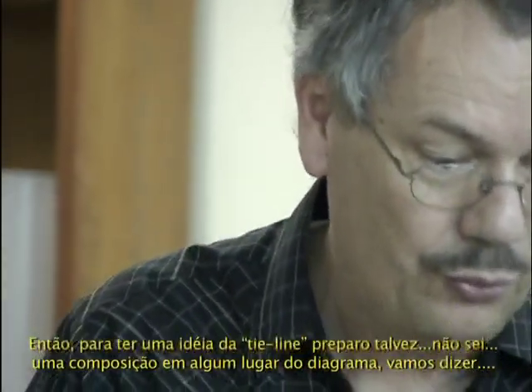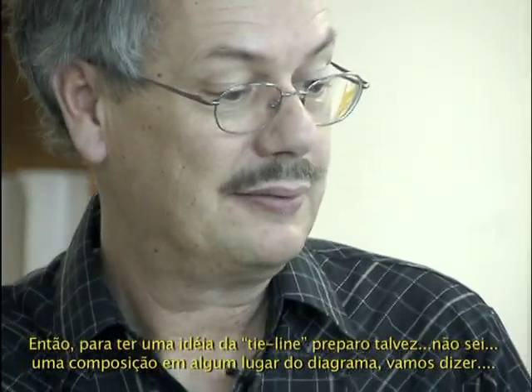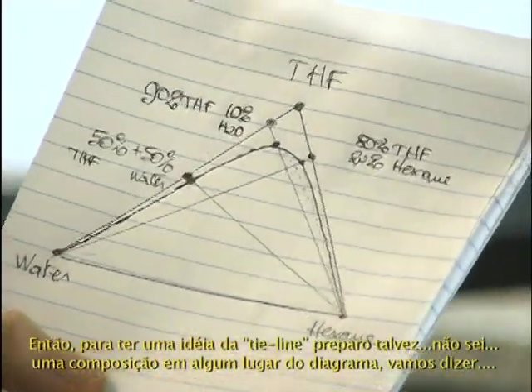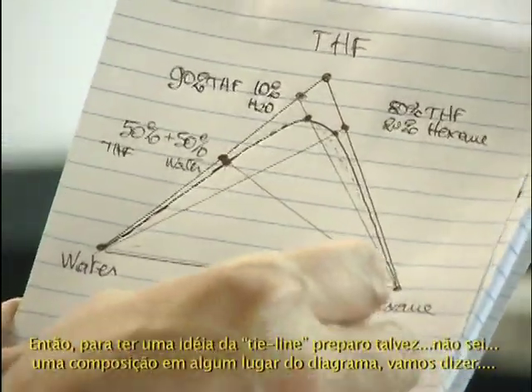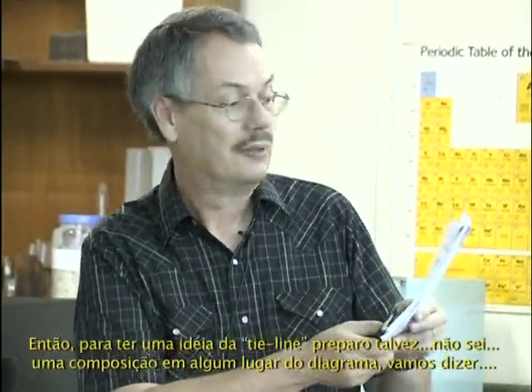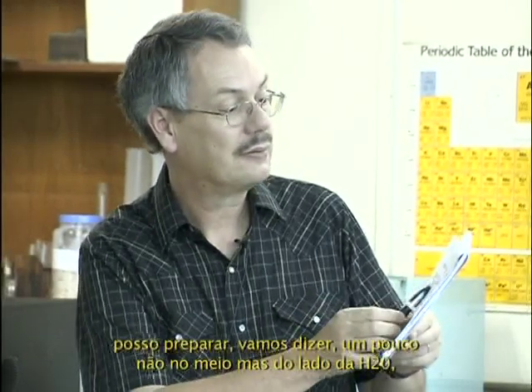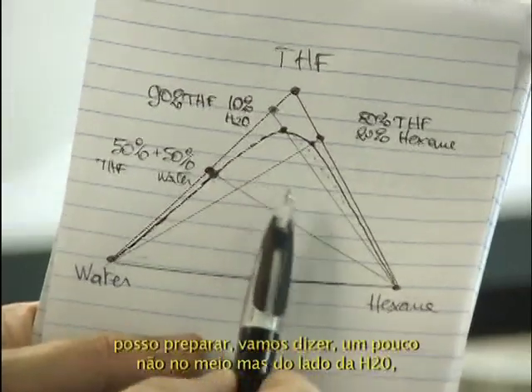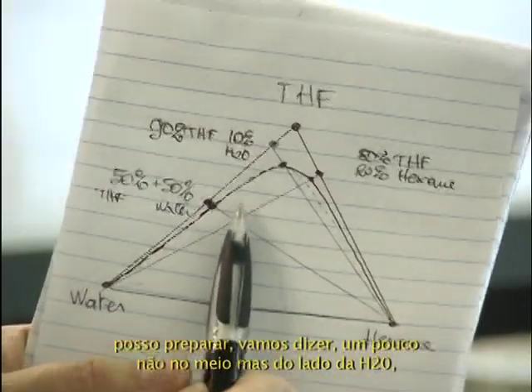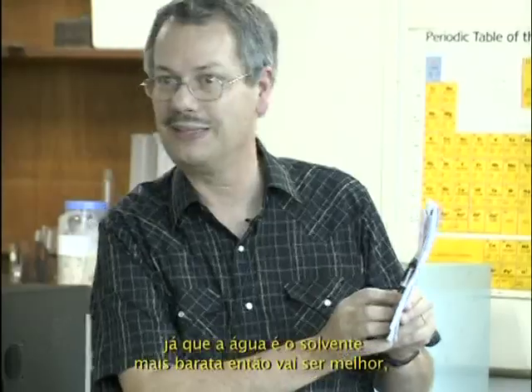So to have an idea of the tie line, I will prepare a composition somewhere in the diagram. Say, a little bit, not in the middle, let's say on the water side, since water is the less expensive solvent.